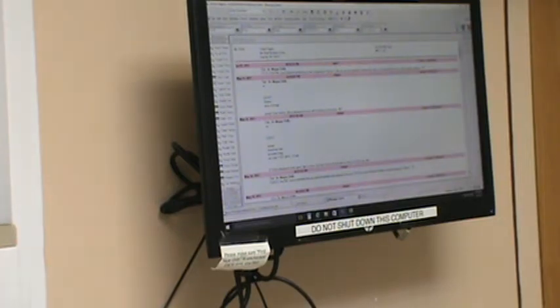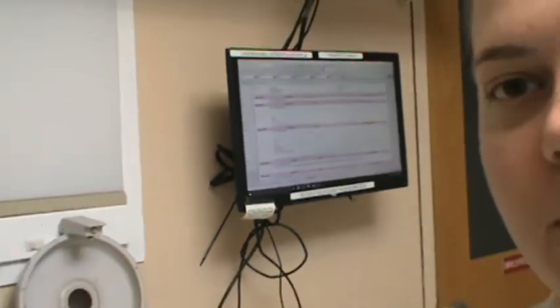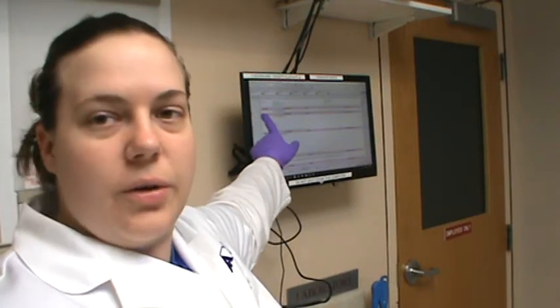Alright, so we're just going to zoom back out. So again, typically on skin scrapings, what I usually am looking for when we do it in-house in my hospital is if there's any bacteria, any yeast, if we see any parasites like Demodex or scabies, any abnormal cells. Sometimes you can see some cancer cells on a skin scraping. But again, I did not see any of those. The only thing I saw on the skin scraping were some red blood cells, some hair follicles, and just some regular epithelial cells. So again, I called Gizmo's skin scraping negative, which is noted in the computer right here. Alright, so that is how you complete task 14, which is just doing a skin scraping.